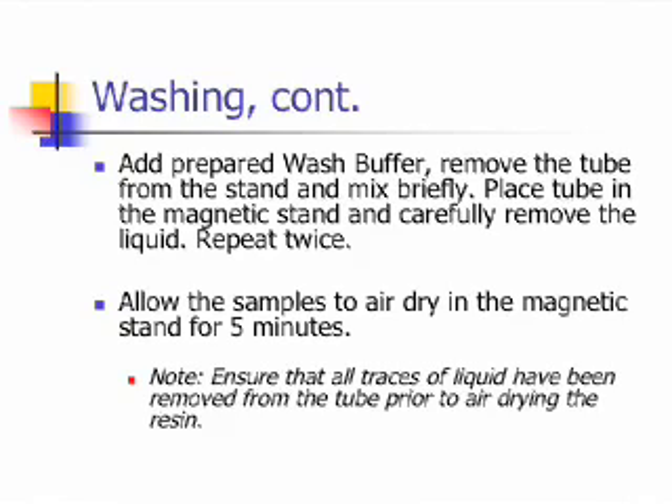The next part of the washing step uses the wash buffer. Add prepared wash buffer, remove the tube from the stand and mix briefly. Then place the tube in the magnetic stand and carefully remove the liquid. Repeat this process twice. Allow the samples to air dry in the magnetic stand for 5 minutes. Ensure that all traces of liquid have been removed from the tube prior to air drying the resin.